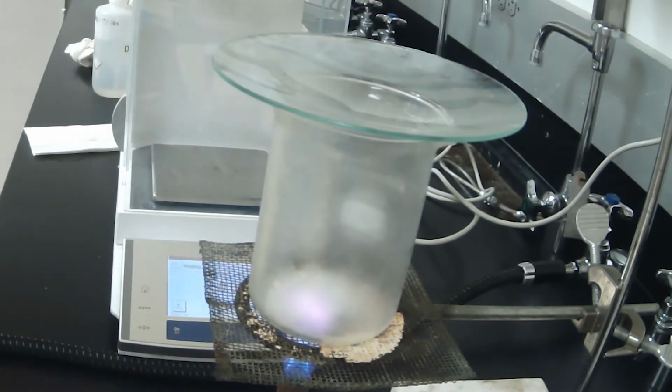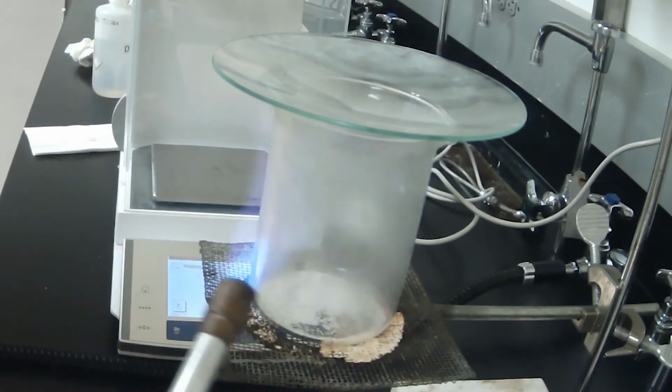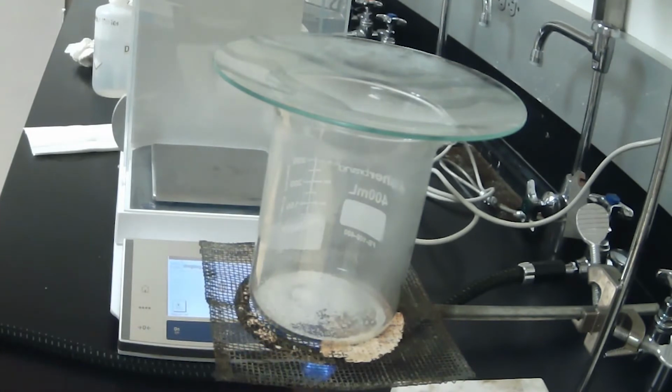Today is a little bit humid, and you should see that immediately there's kind of a steam-like appearance. We don't want that. That's going to all go away eventually. But what will happen is as the bottom of the beaker becomes hot, our ammonium chloride is the only compound of the three that can sublime. So I'm going to try to defog this part of the glass. You can actually see that we're starting to form a smoky-like appearance.